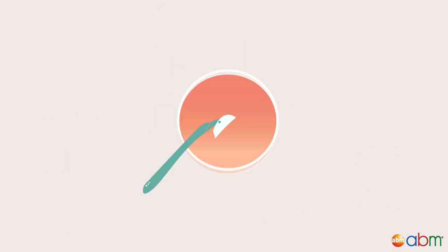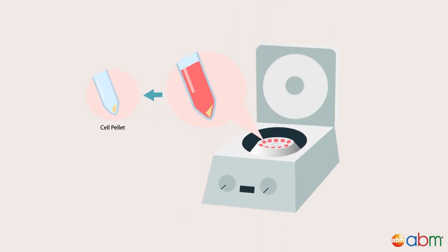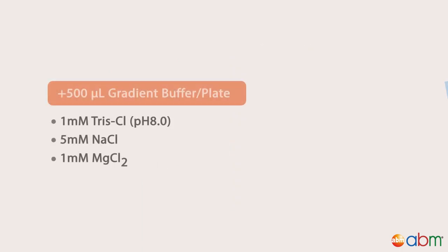Collect cells and supernatant using a cell scraper and centrifuge at 3,500 rpm for 20 minutes to pellet the cells. Resuspend the cells in 500 microliters of gradient buffer per plate. Resuspended cells can be stored at minus 80 degrees Celsius if purification will not proceed immediately after cell collection.